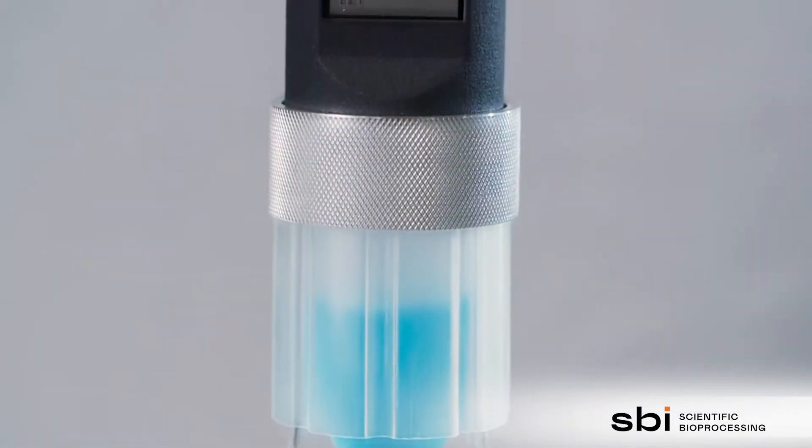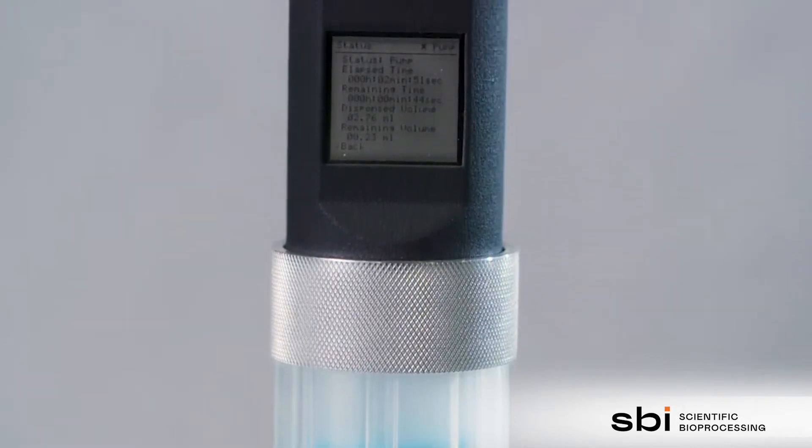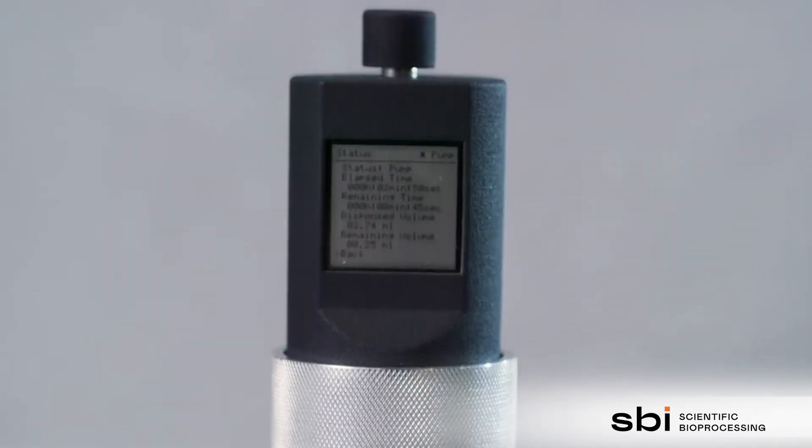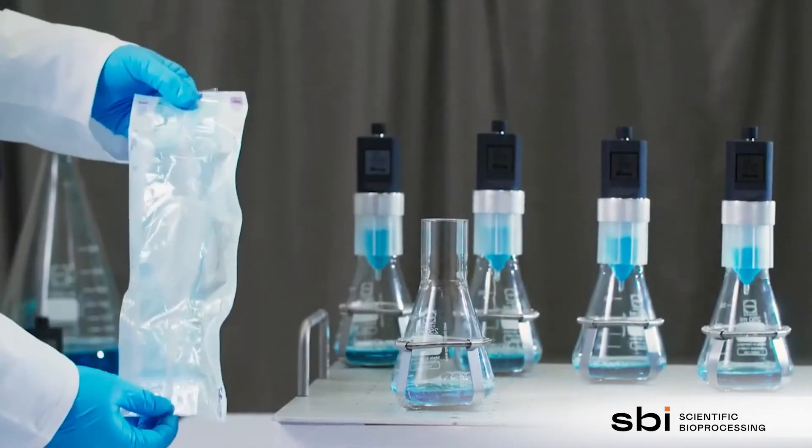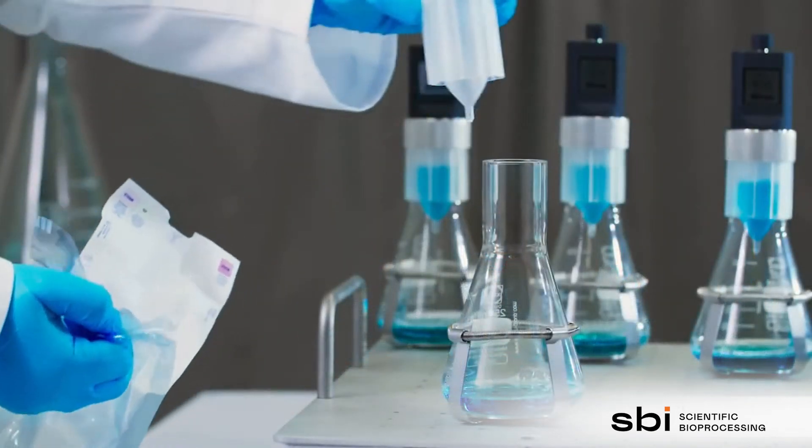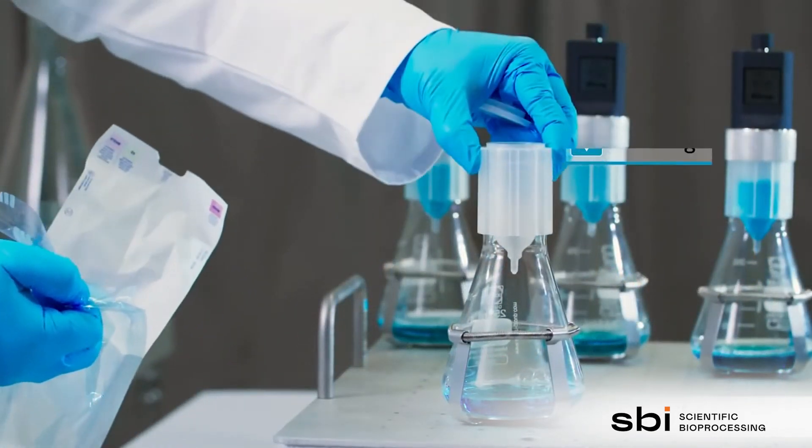It consists of two main components, the LIS cartridge and the LIS drive. The cartridge is a sterile, single-use container in the shape of a shake flask lid.